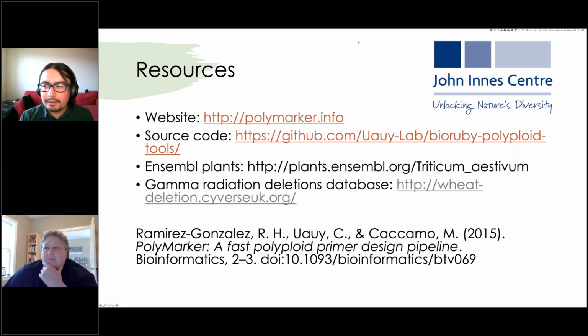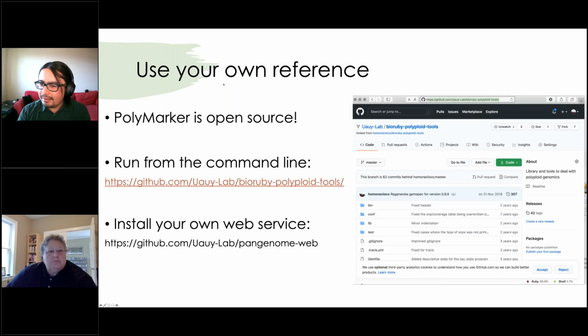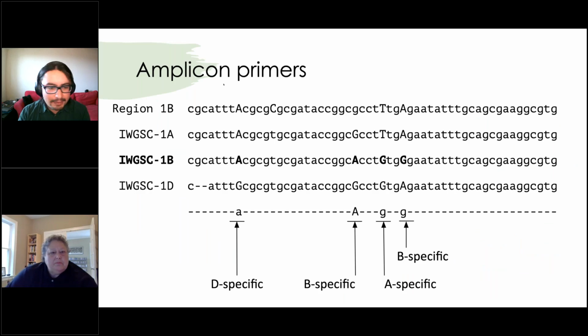All right. So what are Hemisnips? Hemisnips, I don't like that they are called Hemisnips because they are not really SNPs, because a SNP needs to be in a population, but usually people use Hemisnips to refer to the different variations between the 3 different genomes. Can you see my screen? Yes, we can. Okay, so in this particular example, the ones that are marked as B specific or D specific are Hemisnips, because here, if you look at it, there is a variation that here becomes G and then A, but it's not something that you will find in the population, or probably it can also happen, but these are just variations within the same organism. So that's what is usually called a hemisnip.